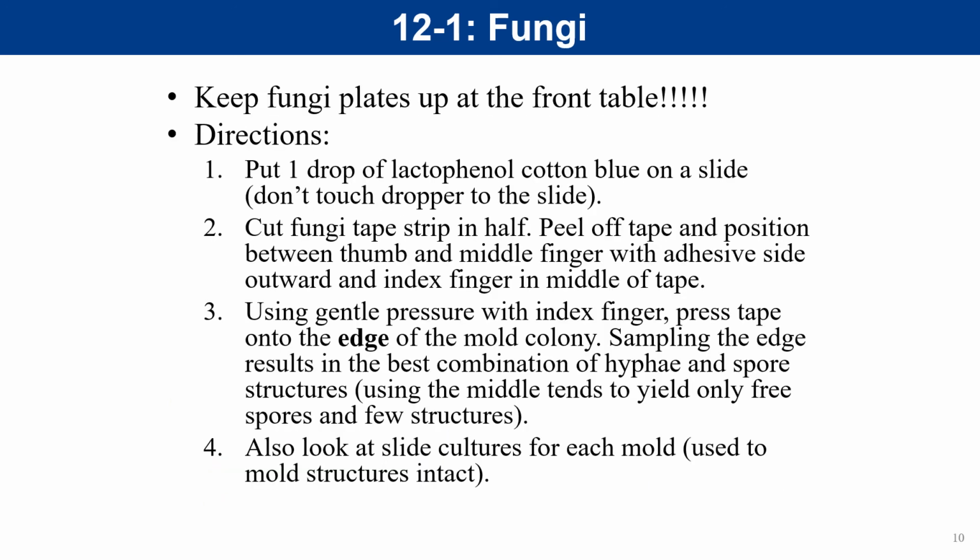Finally, we'll end today's laboratory activities by making our own fungal tape mounts. So you can take the plates just like you saw pictured in the presentation, and then you take some sticky tape and push that down onto the plates, and then you'll place one drop of lactophenol cotton blue, which is a blue dye that will be put onto the slides so as to color the fungi. It also helps to make the fungi safe for study because it kills them as they soak up the blue dye. And then you'll be placing those under the microscope and looking at the various features that I talked about in the previous slides.